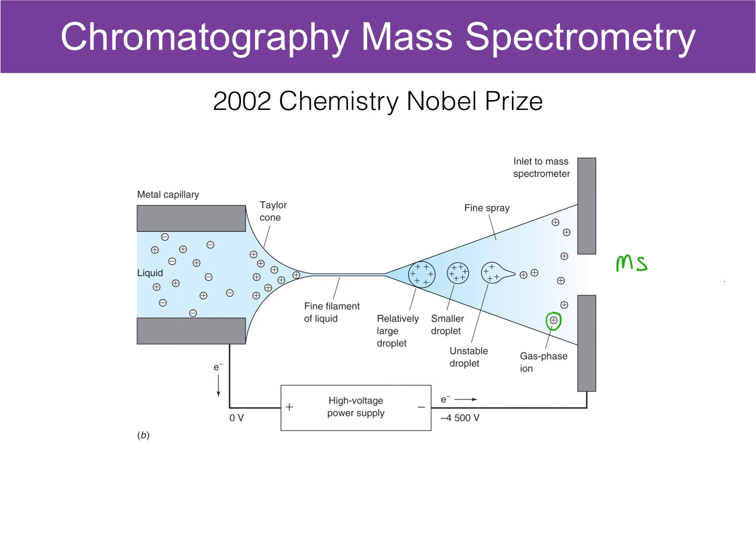And that's how we go from this high pressure liquid state to a low pressure gas state. And this intersection between these two techniques has revolutionized analytical chemistry, and it is an engineering masterpiece.